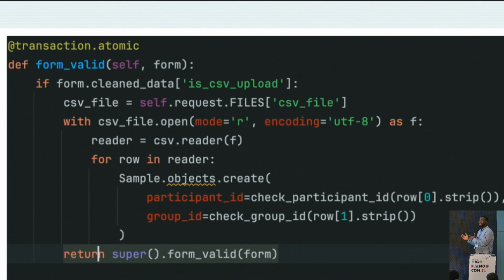Another thing that we have to check is, what's the group? Because as you're receiving a sample from a patient, you're also receiving samples from their family members. So we're not just doing testing for patient A, we're also doing testing for their family members, brothers, sisters, mother. Maybe they've had cancer in the past. So you need to check, does the group exist? And when you're sending the data out to the lab, you need to go with the family data. So we have other validations that we'll do in that.